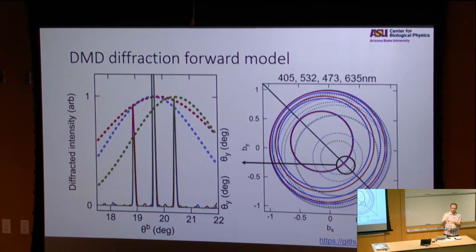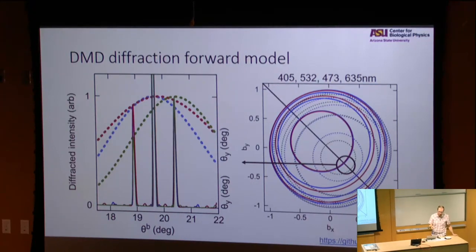But the big disadvantage of this oblique plane is that to generate a full 3D volume, it's got to go all the way over, right? If it was sitting in one spot, then you could just do this and you would go a lot faster. So if we were interested in one molecule's behavior, then it would definitely be a much better way to go to trap it.